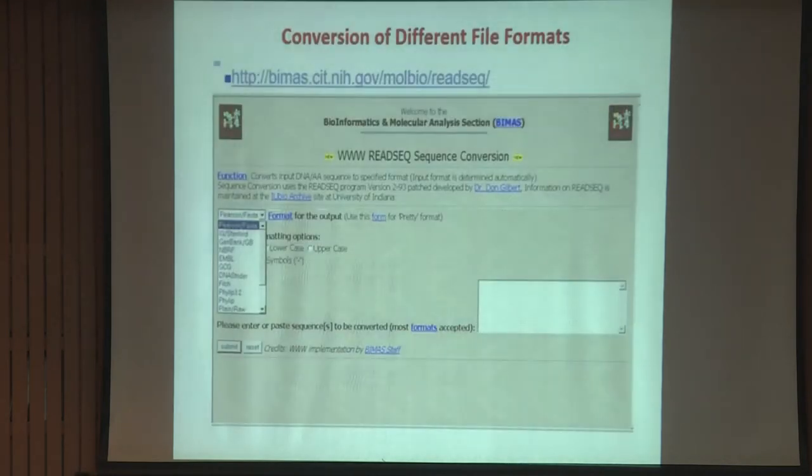If you are not using those things, try to use others, different things. There are many more. The list goes and goes and goes. The Expasy translate tool is the most popular one. But don't think that that is the only place where you can translate your sequences. Okay, there are a number of options. Okay, yeah, please proceed.